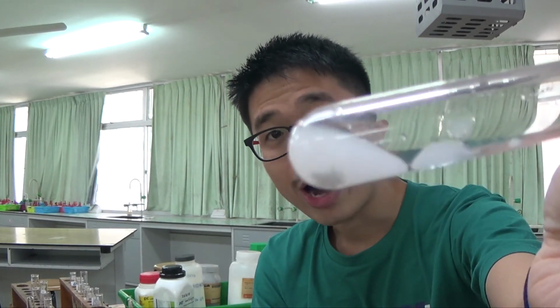If it does not dissolve in dilute aqueous ammonia, then it must be bromide. White and cream precipitates are very difficult to tell apart. However, it's much easier to distinguish a yellow precipitate. If you have silver iodide, Ag+ I-, AgI, the yellow precipitate is very easily distinguished.